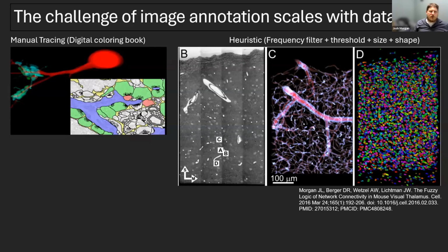And so from image to image or over time, there might be a little bit of stigmation drift, and you can automatically stigmate. Sometimes that fails. So that's why automatically detecting poor quality images is nice because you can just tell the microscope to refocus or restigmate, but there's always a little bit of patchiness that gets through that, in our experience at least.